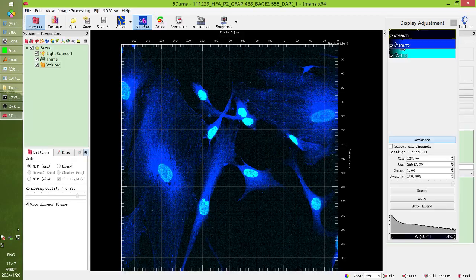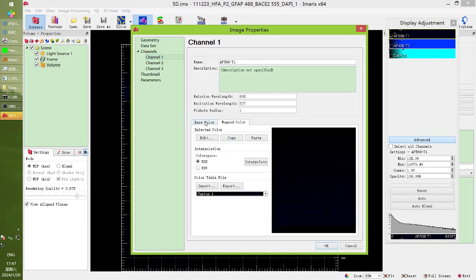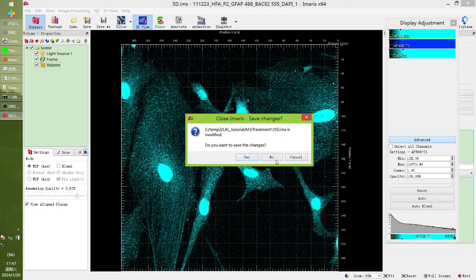Base2 is the first channel. Oh, it's no problem. It's no problem. Sorry. They're correct.